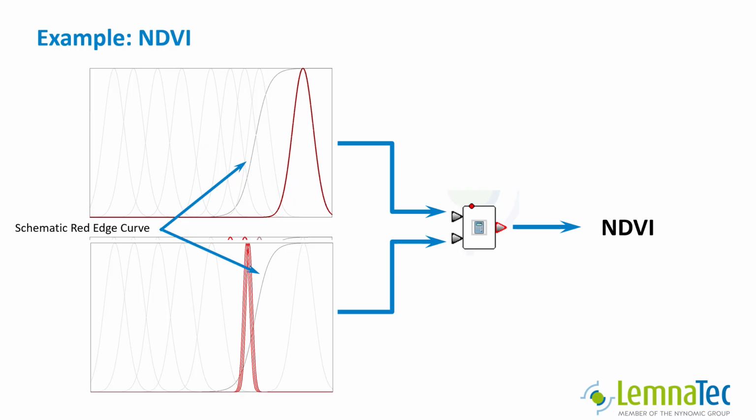For the wavelength maxima of each light source in your multispectral imaging system, please check your manual or ask us. Your system can be equipped with up to 5 filters. Please choose them carefully for your intended use case.